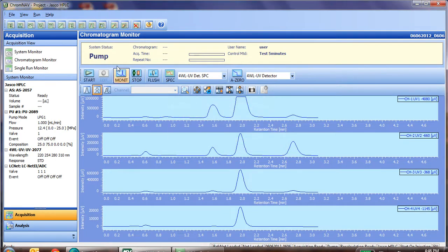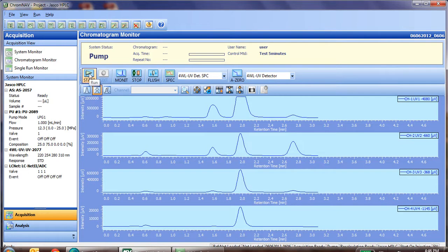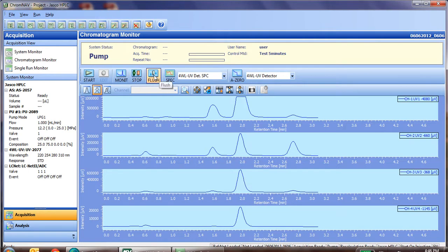Now the pumps will continue the run, as shown by the system status, until you stop them. If you'd like to run the sample again, you can click the start button. Otherwise, we can stop the pumps as we're finished, we can flush the auto sampler if we'd like, and we're ready to go to the data analysis side.